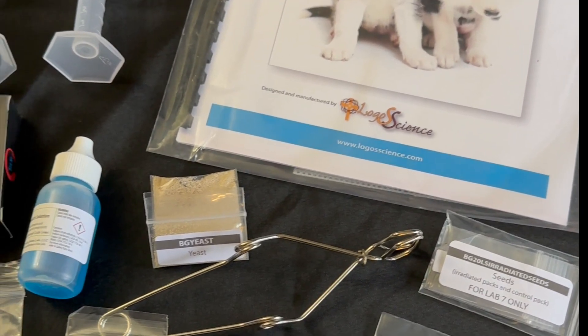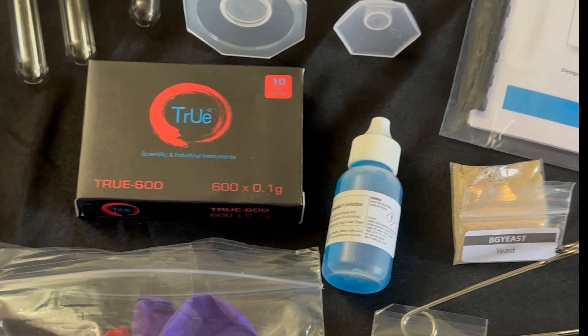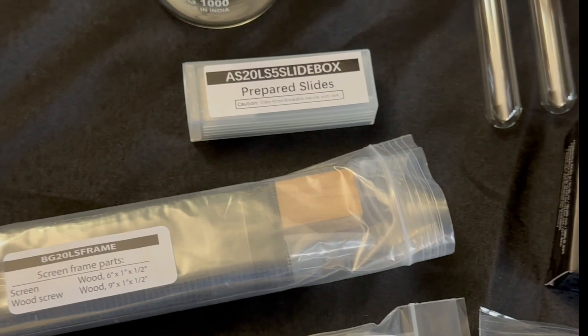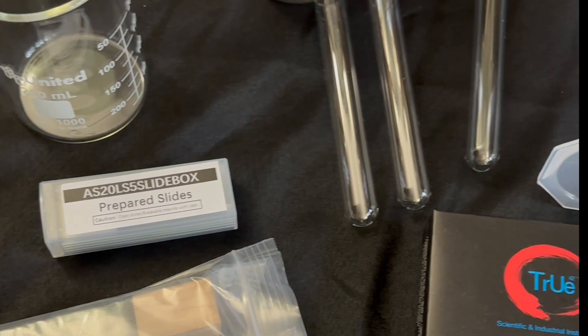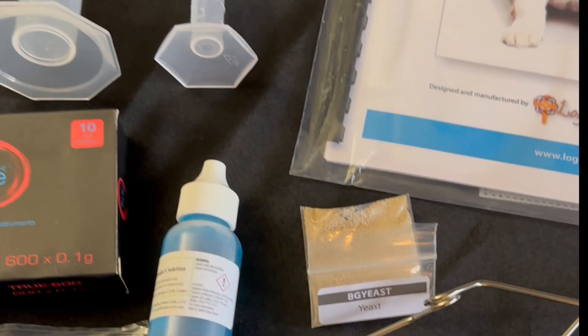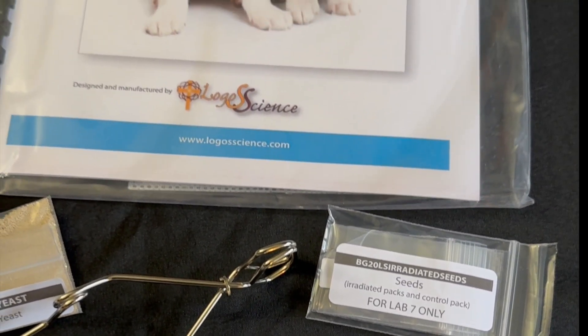When you open your science kit, you will find most of the items packaged and labeled to make them easier to find. You will also find a list of supplies needed. Most of these are easily found in your household or your school supplies.